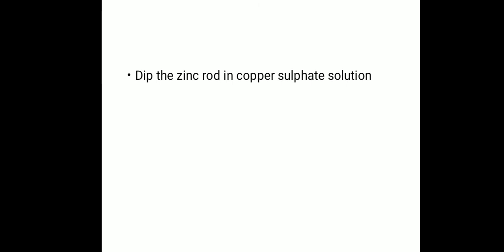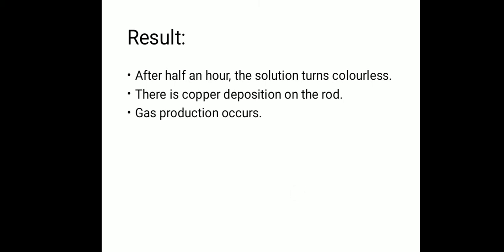For the purpose of this reaction, the procedure is that we have to dip the zinc rod simply in the copper sulfate solution and keep it there for about half an hour. This is the beginning of the reaction. It is indicated by the presence of bubbles.